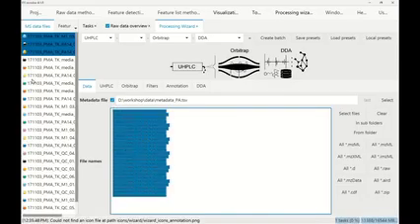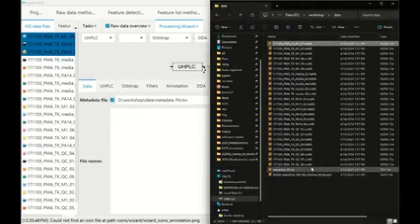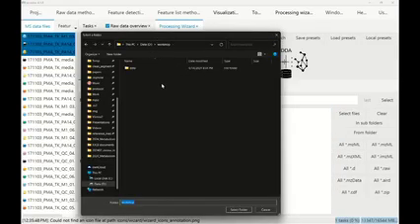But for this, you can also just drag and drop all the MZML files from the Explorer. We can just drag and drop it in here. Or what is also quite easy, you can just say all .mzML files, and we select the data folder.